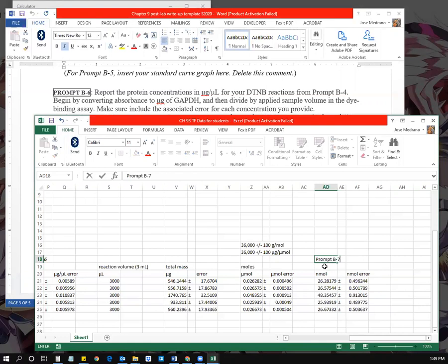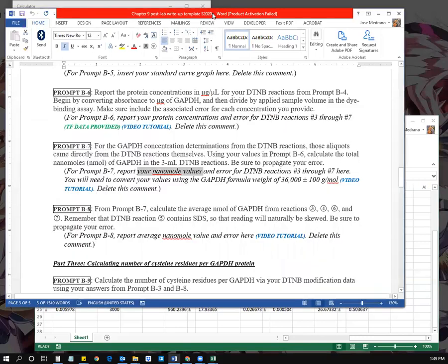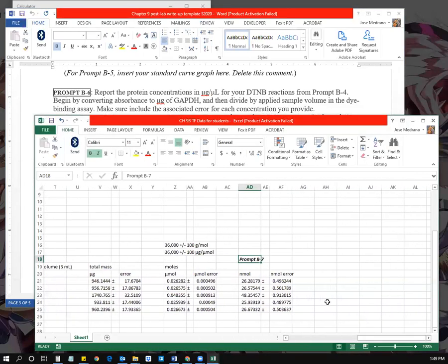All right, so when I have my prompt B7 values, the last part for this tutorial video is going to show you how to take the averages of the non-skewed reactions. So reactions 3, 4, 6, and 7, because we're tossing out reaction 5 because that has SDS in it. So now for prompt B8, what we're going to do is just report one single average value.